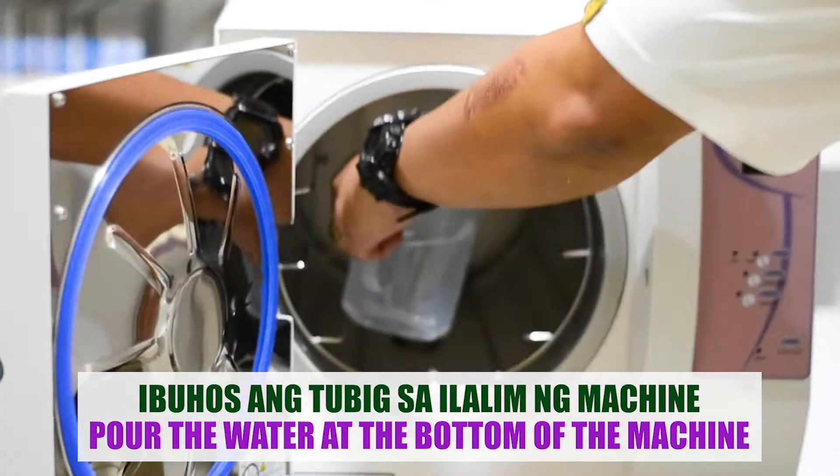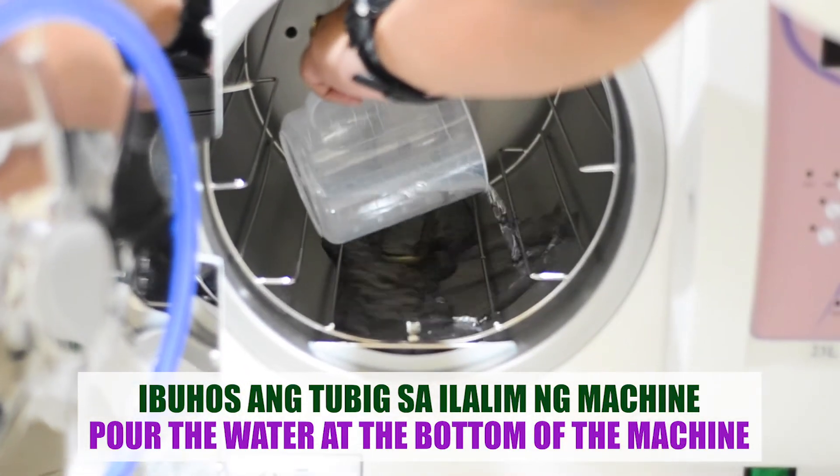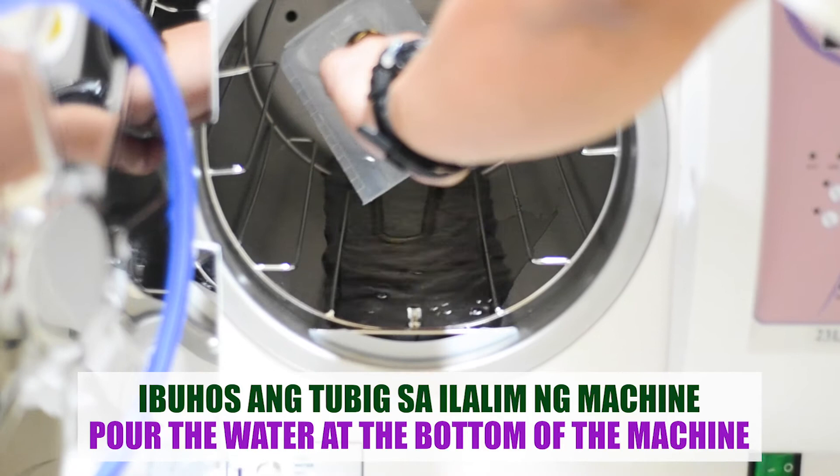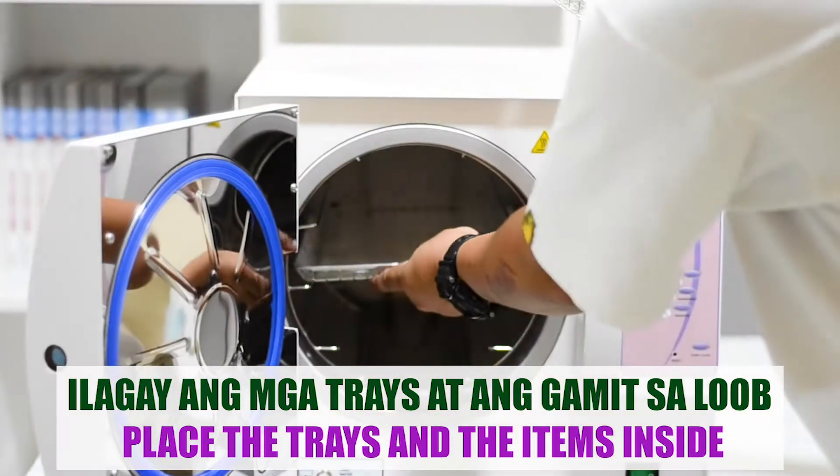Pour the water into the bottom of the machine. Then place the trays and items to be sterilized inside the machine.